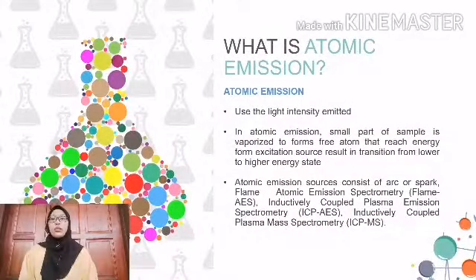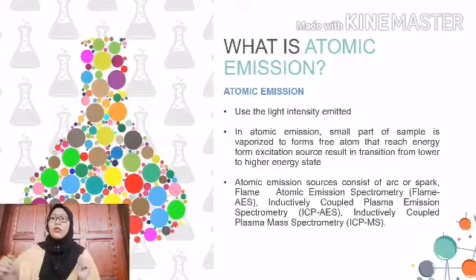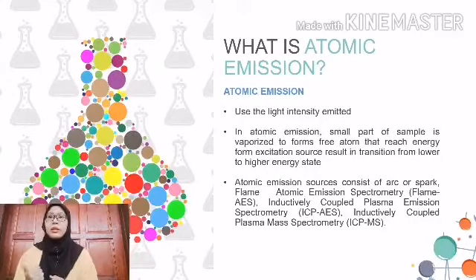Next, what is Atomic Emission Spectroscopy (AES)? AES is a procedure of chemical analysis that uses the light intensity emitted. In atomic emission, a small part of the sample is vaporized to form free atoms that reach a higher energy state from a lower one. On returning back, they emit a photon of radiation. AES sources consist of flame atomic emission spectrometry (flame AES), inductively coupled plasma emission spectrometry (ICP-AES), inductively coupled plasma mass spectrometry (ICP-MS), and also arc or spark.